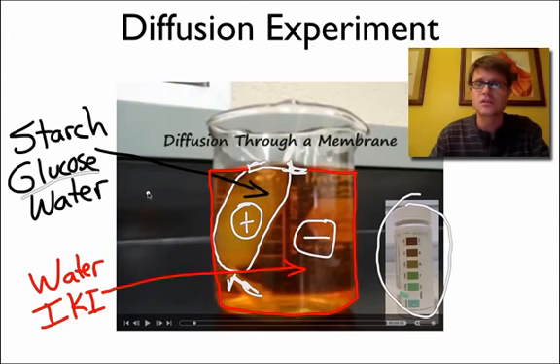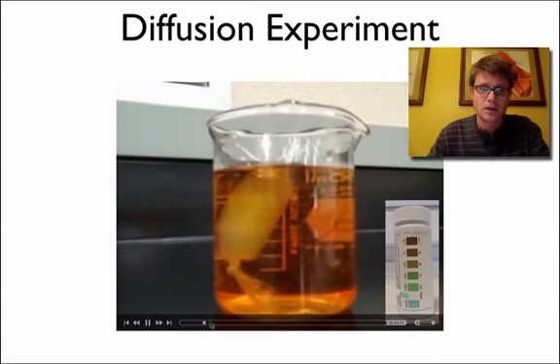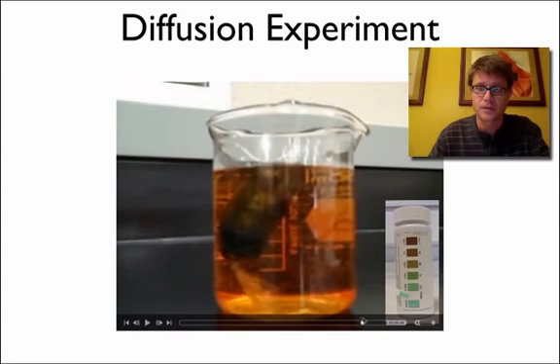And so this is what it looks like when it starts. So I'm going to have to get rid of this writing for a second, and then we'll play the video for a bit. And you can see immediately that it starts to get a coloration change inside the beaker. And let me kind of move it up a little bit faster. So we'll look all the way out here. And let me play it there.